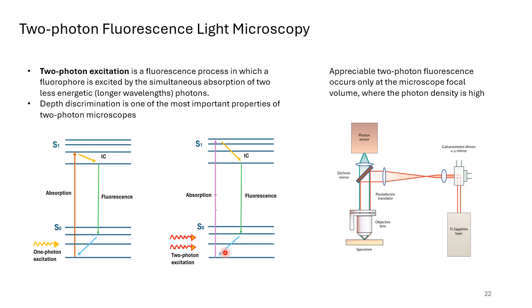Since this process depends upon the simultaneous absorption of the two photons, the probability of two photon absorption is a quadratic function of the excitation radiation. This is a basic diagram of a two-photon fluorescence microscope. Two-photon microscopy is intrinsically capable of optical slicing, and no pinhole-based spatial filter is needed here to block the signal from the out of focus region.